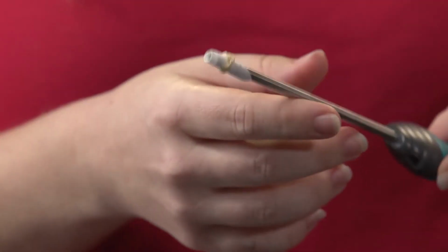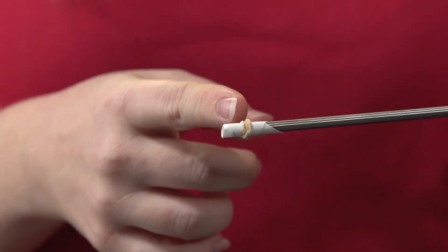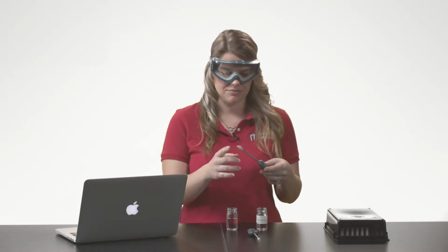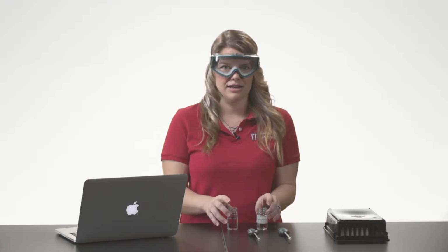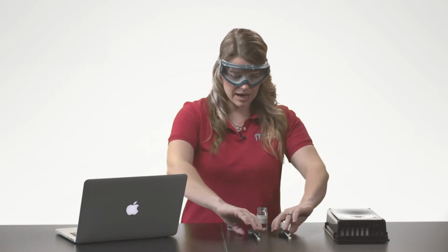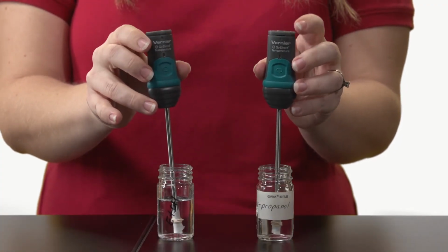I wrap a small piece of filter paper around the tip of the temperature probe and tighten it with a rubber band. My propanol and ethanol samples are ready. To begin the experiment, I want a few data points to get a baseline before evaporation begins. So go ahead and place the temperature probes in your solutions.